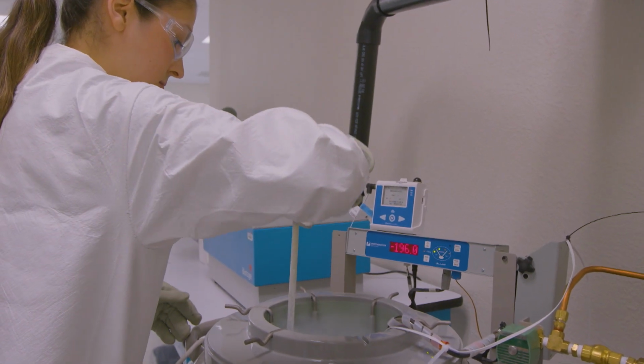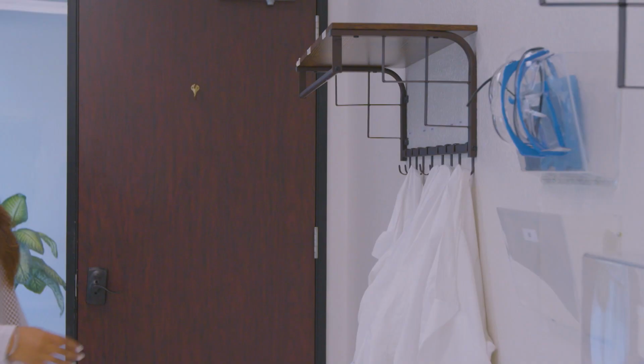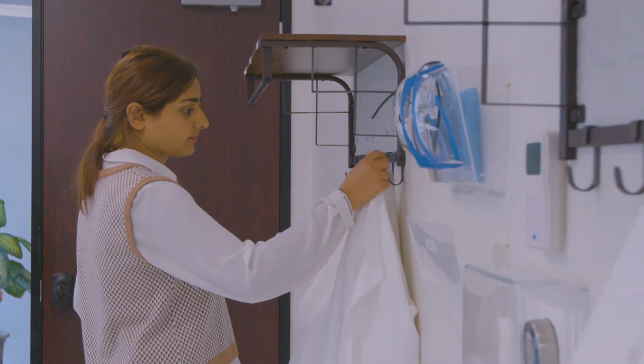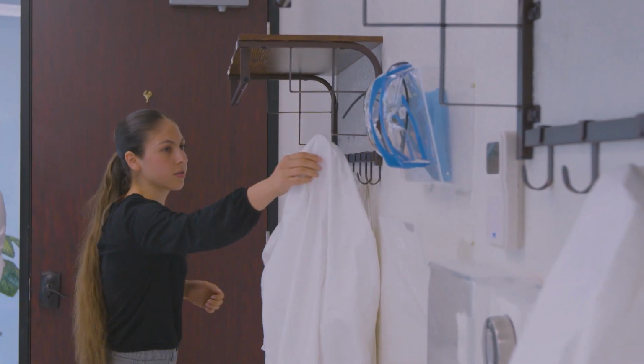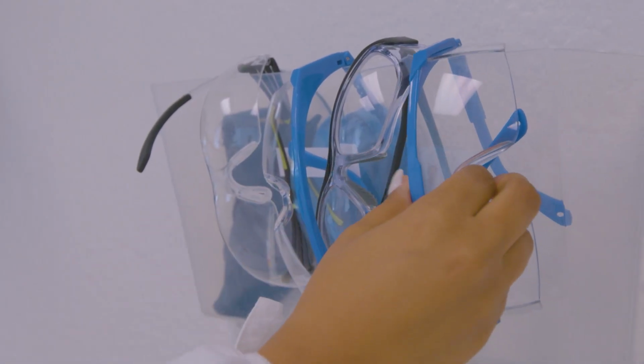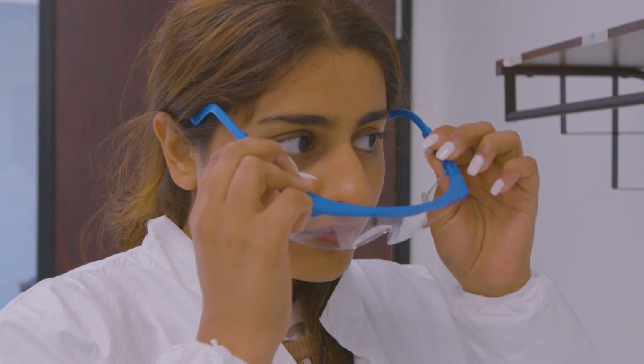The pivotal role of analytical testing is to generate data to make transparent the product's identity, strength, purity, quality, and safety. We achieve better data primarily through instrumentation and people. Instruments need to be clean, well maintained by trained, qualified people. We have rigorous cleaning procedures that ensure no cross-contamination. All this leads to highly sensitive data so that we can separate signal from noise.